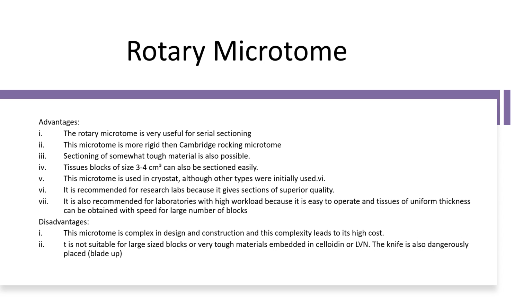It is also recommended for laboratories with high workload because it is easy to operate and tissue of uniform thickness can be obtained with speed for large number of blocks. So there are some disadvantages as well.